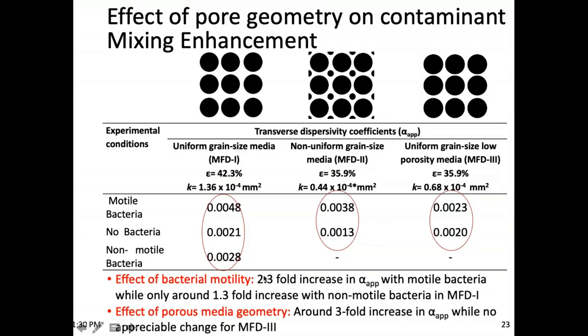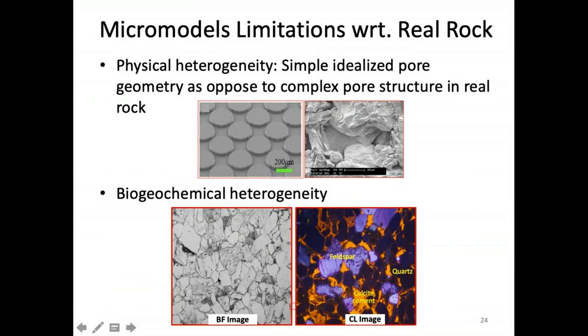But I won't go into that detail, but we saw about a 2.3-fold increase in mixing, basically, in this case, as compared to when there was no bacteria. I just wanted to switch to this one. So these are the traditional experiments that people do with these traditional micromodels.